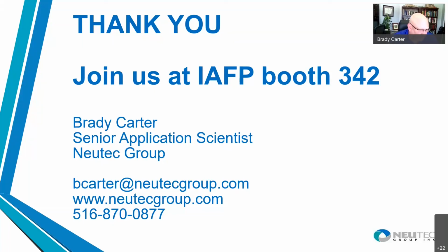So water activity, relative humidity are essentially the same thing. Water activity is measured as equilibrium relative humidity, but they're related such that if you had a product at 0.4 water activity exposed to a room at 70% relative humidity, then it's going to uptake water and it's going to change its water activity.